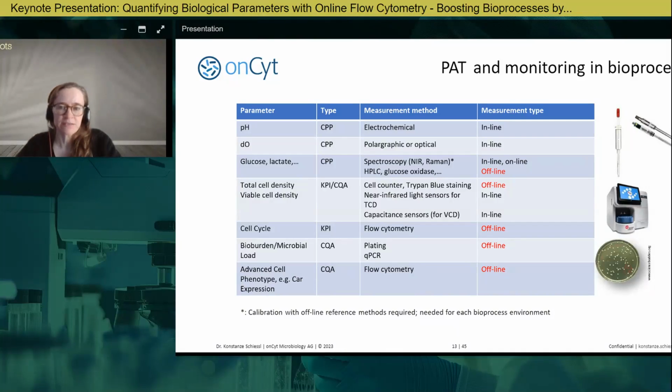And I marked the offline here in red because it's from the view of PAT, right? You really want to have a full process understanding and process control. And for that, you should always aim for inline or online methods.